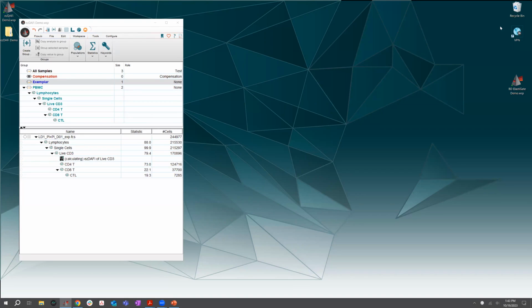Yeah, Lucas, that's a good question. I will say at the moment, it's taking longer than it normally takes for me. I do find when I do screen shares, for some reason, my FlowJo doesn't always keep up. I don't know if I'm just using too much power on my computer. So I will say it doesn't normally take this long. I demoed it just before the call and it was going faster.